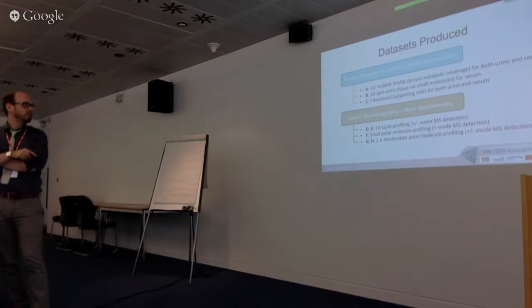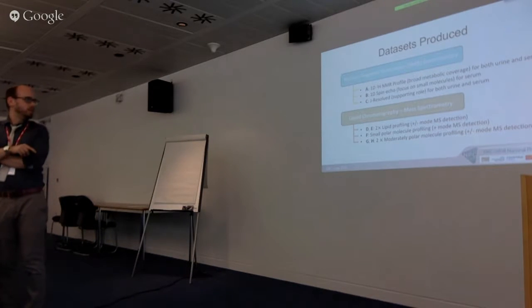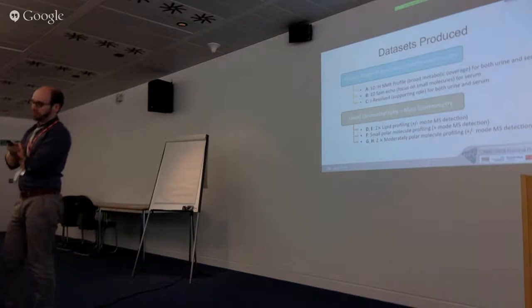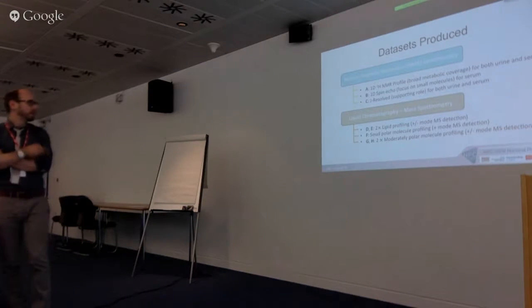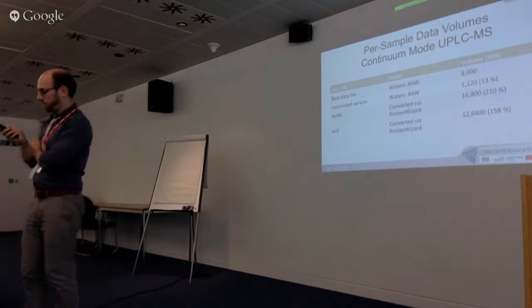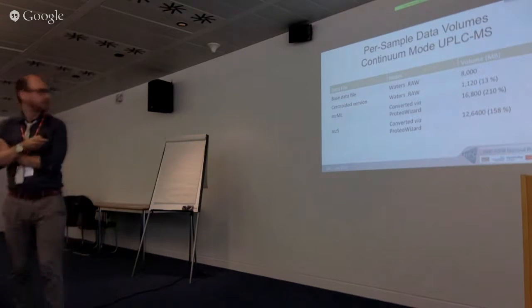On the mass spectrometry side, we run one common assay between urine and plasma, which is the HILIC small polar molecule detection. And then depending on whether we're looking at blood products or urine, we'll either do a lipid-specific assay or a reverse phase assay. And this is just for technical reasons, but they're both your typical broad spectrum sort of profiling MS assay.